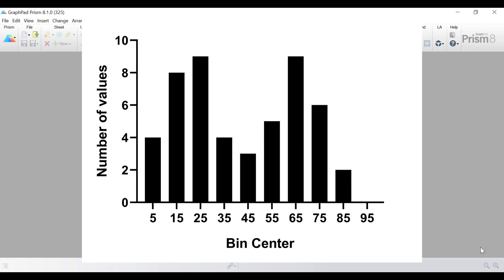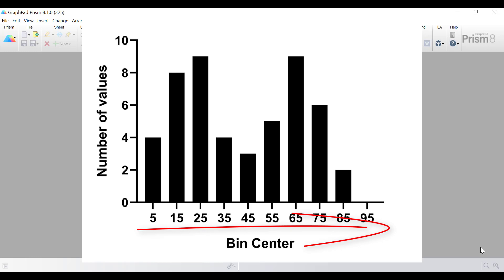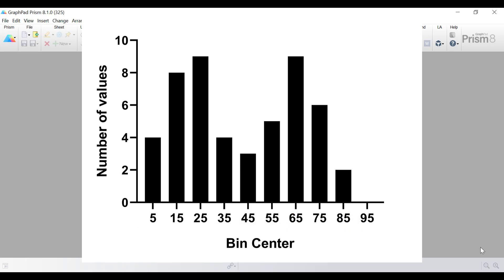In this particular example, the x-axis represents the data being measured. This is usually ordered from the smallest to the largest value and placed into what are known as bins. Each bin contains the number of values that lie within the range of values that define the bin. In this example, the first bin center is 5, meaning this column contains all values between 0 and 10, and so on. The y-axis represents the number of values in each bin.